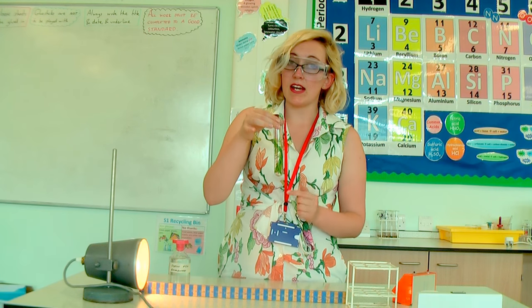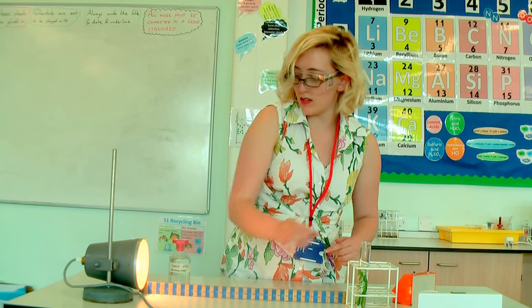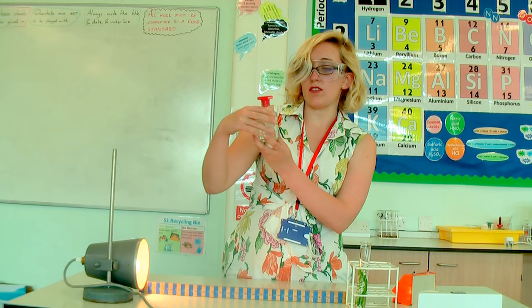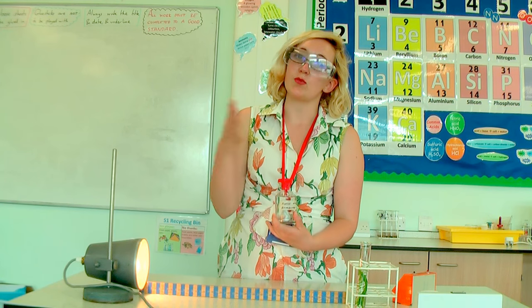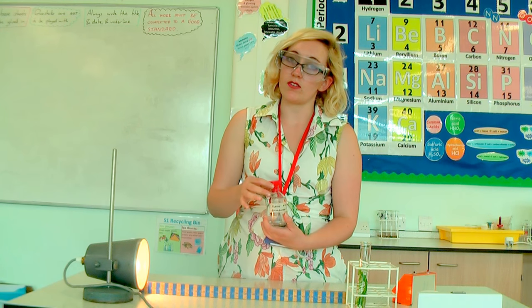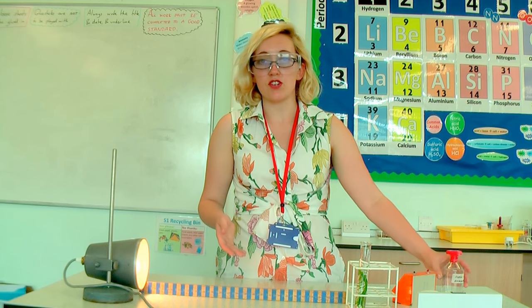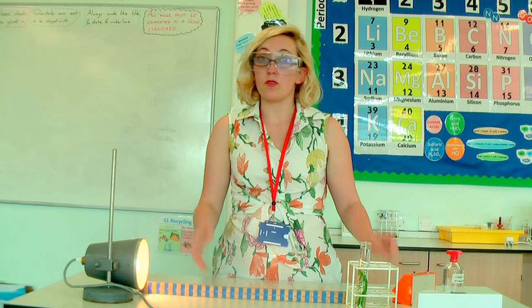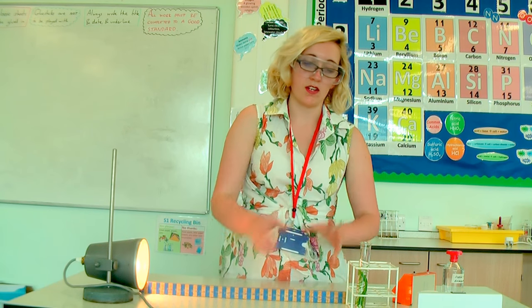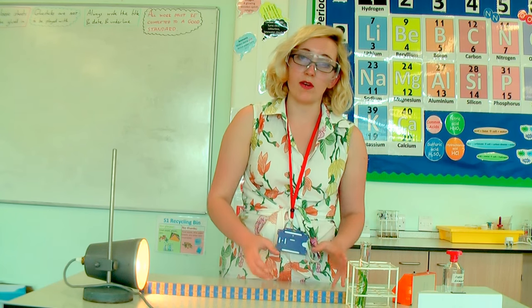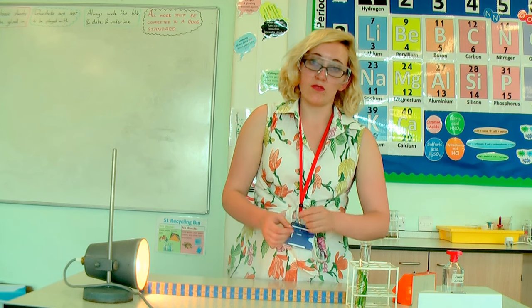I've put some distilled water in here and I've also put some sodium bicarbonate. The purpose of the sodium bicarbonate is to provide carbon dioxide. We don't want one of the limiting factors for this reaction to be carbon dioxide — we want the only limiting factor to be the amount of light. So I've put sodium bicarbonate in just so the plant's got enough CO2 and that's not going to be an issue for it.